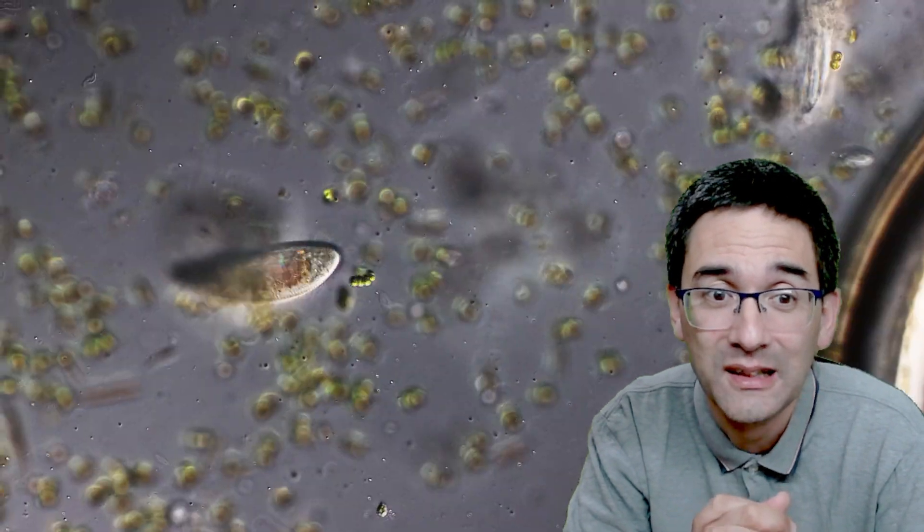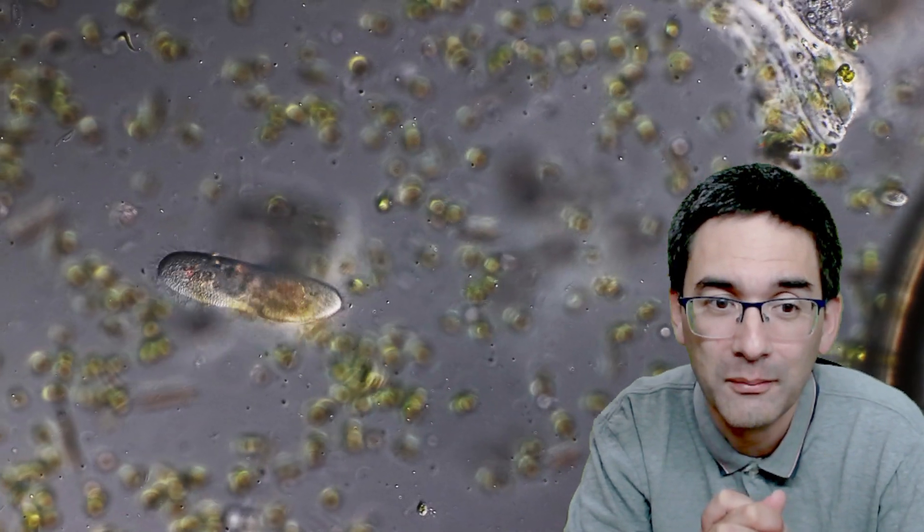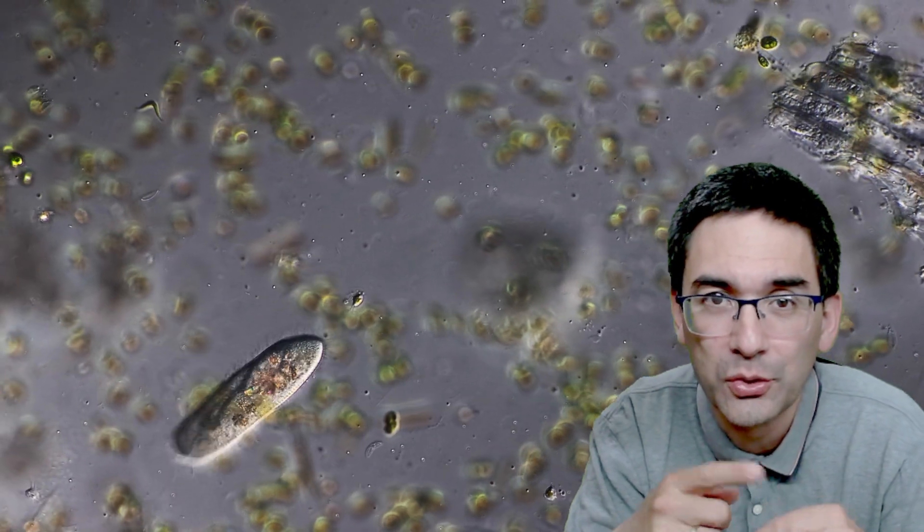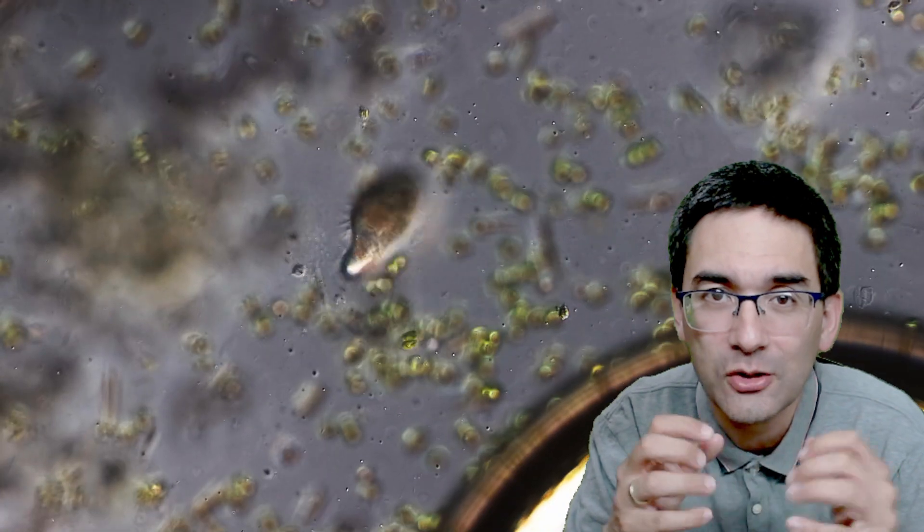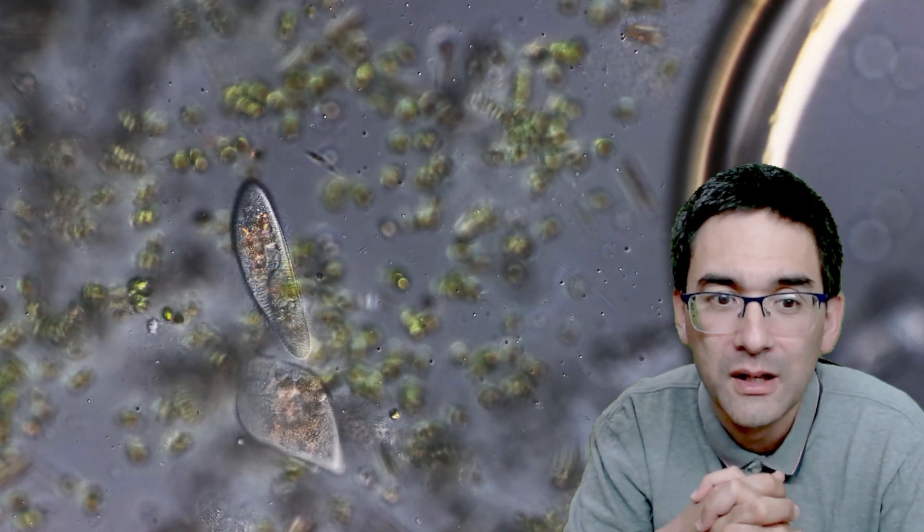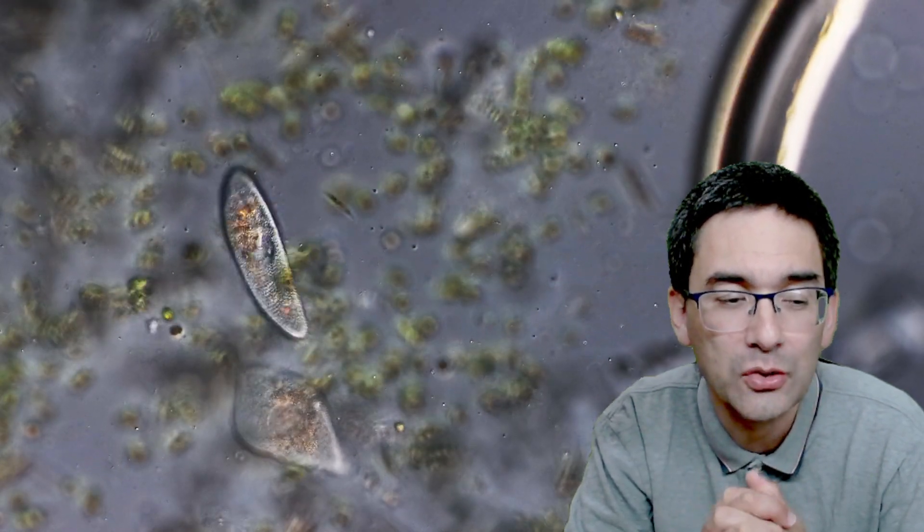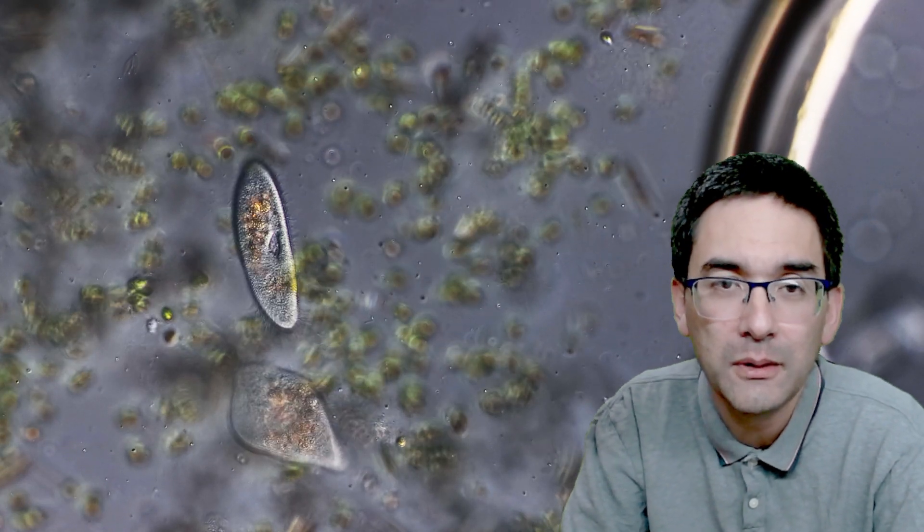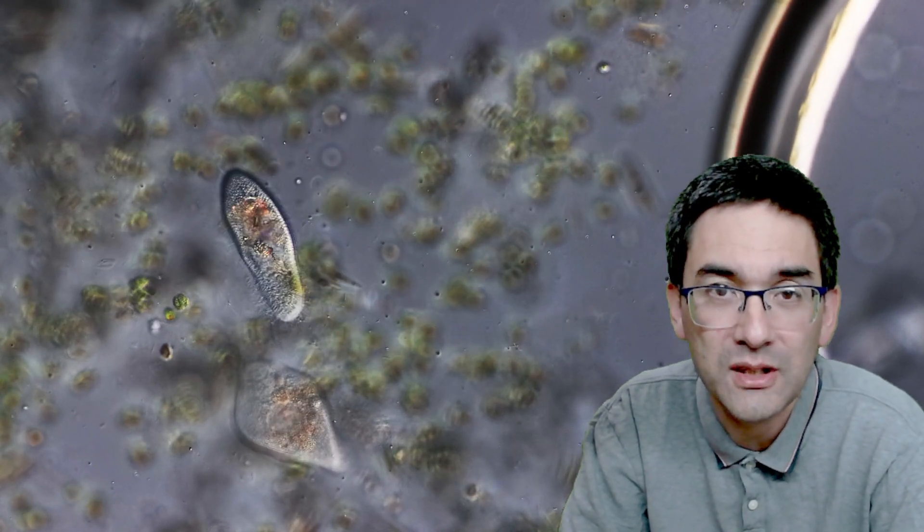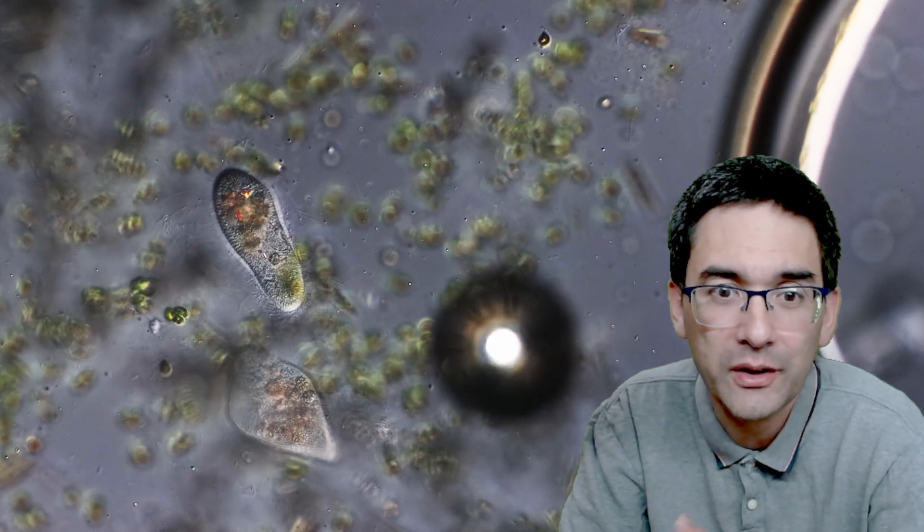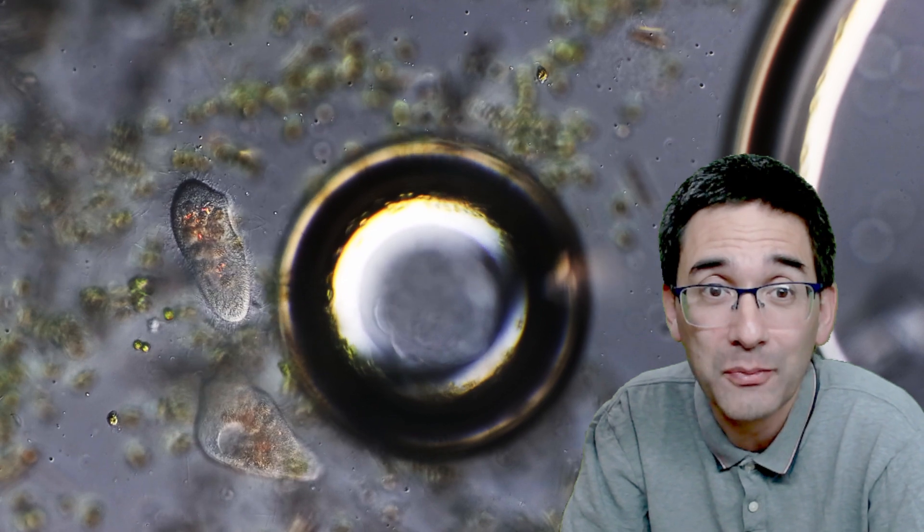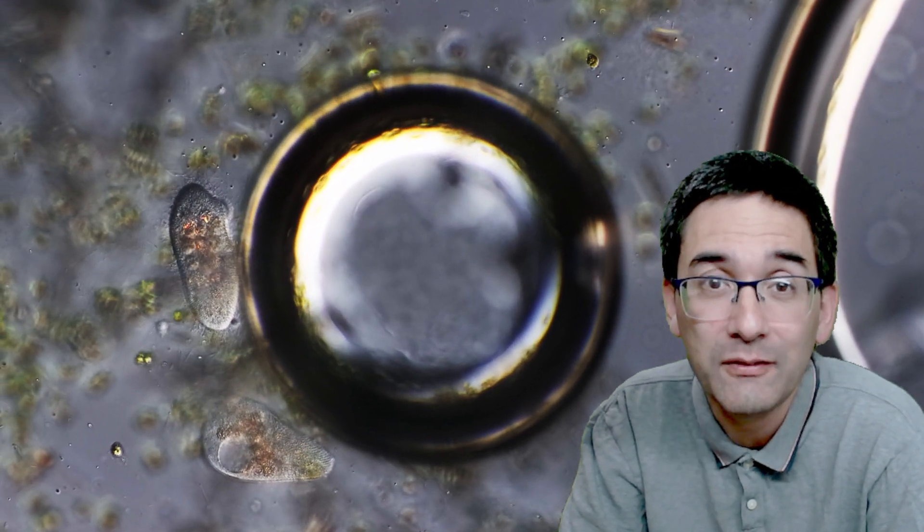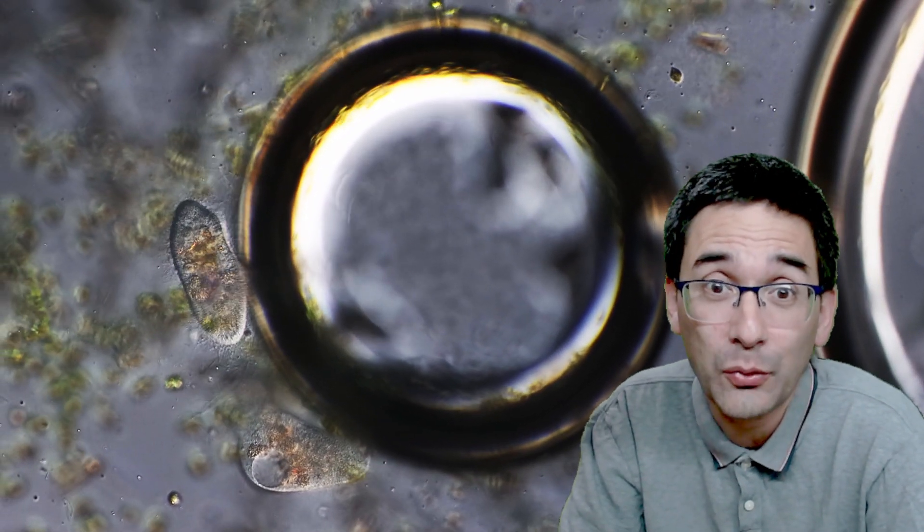Here again, they all start to spin—a sign that they start to lose control. The video starts to loop again. I simply wanted to show this to you—to show the effect of different substances on the activity of cells.